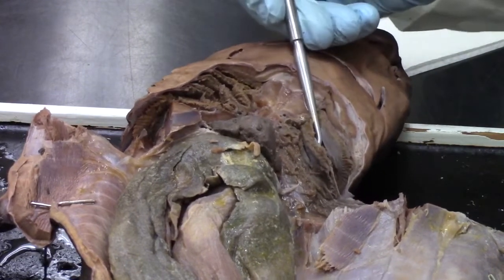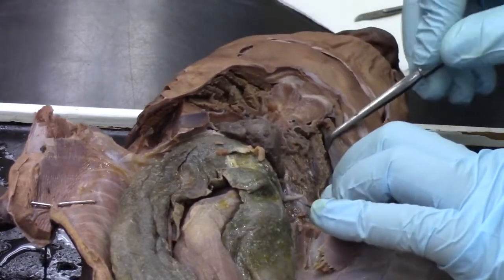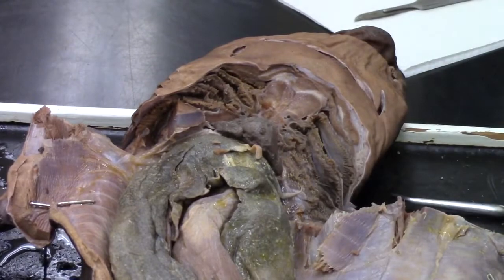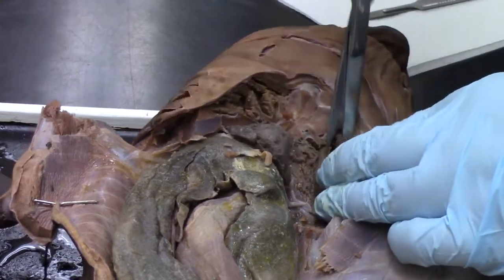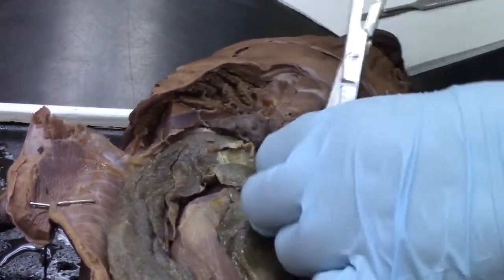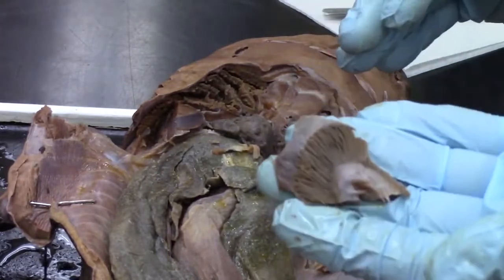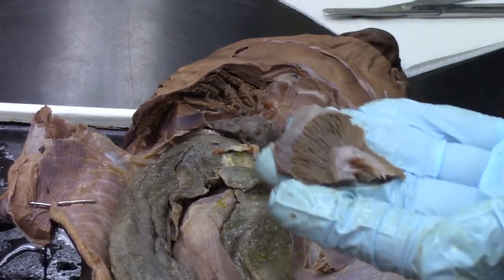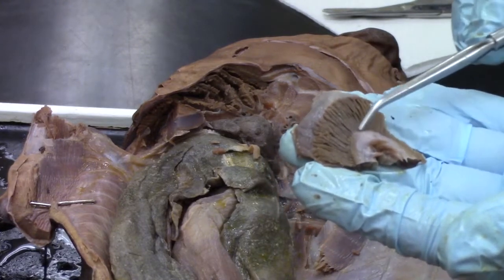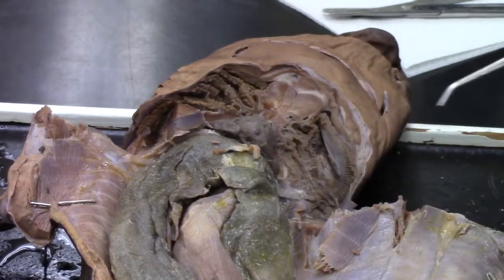But just like in the bony fish, we actually do have a gill structure where we have the gill arch and filament. If we look at this piece in my hand, this region here I've actually cut off the filament, but here we have the gill arch and here we have the gill rakers.